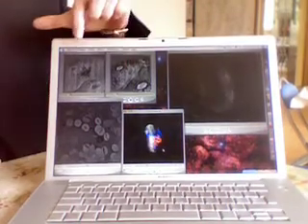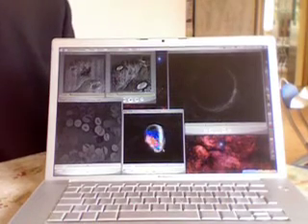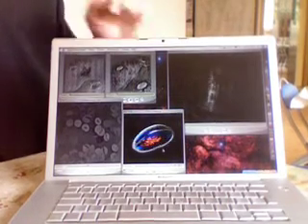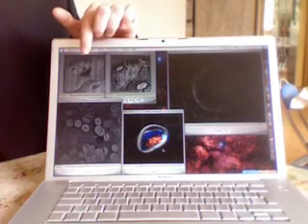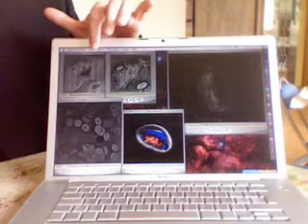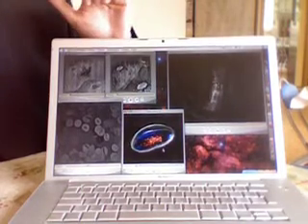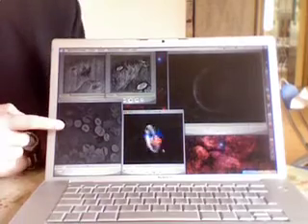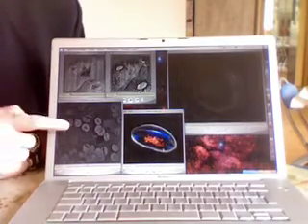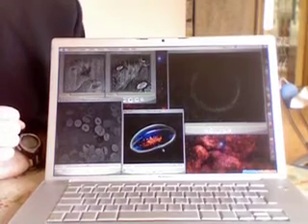For example, on these images, we have cheek cells, which are basically transparent cells, and we measure the index of refraction, and we can see that on the so-called refractive and absorptive parts, we see different features within the cell. Here is another example, red blood cells, without staining again.